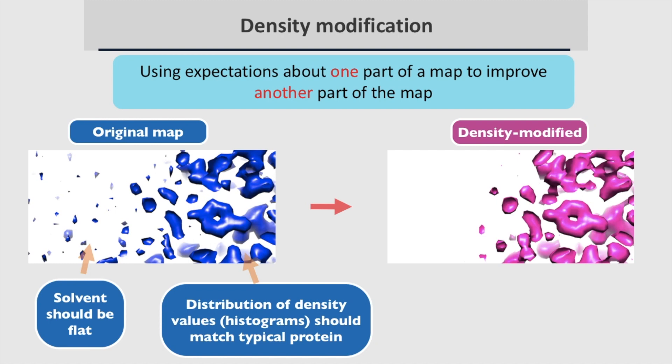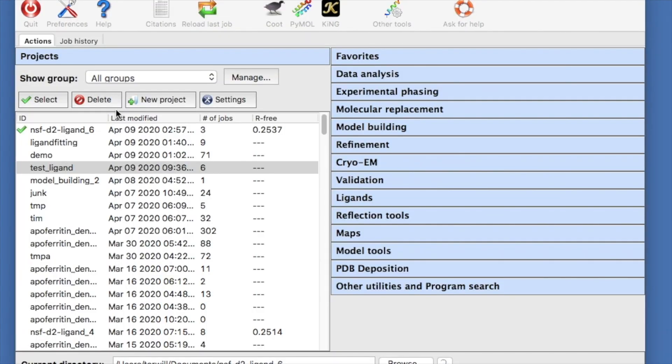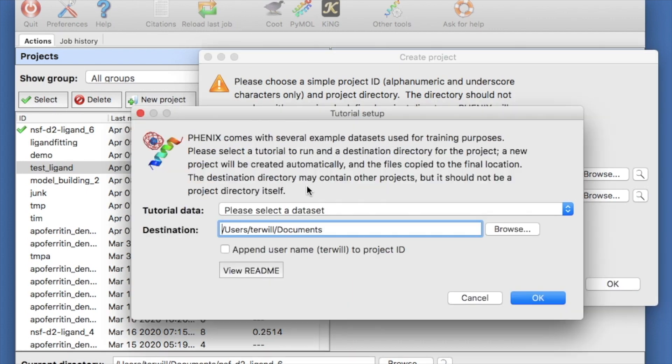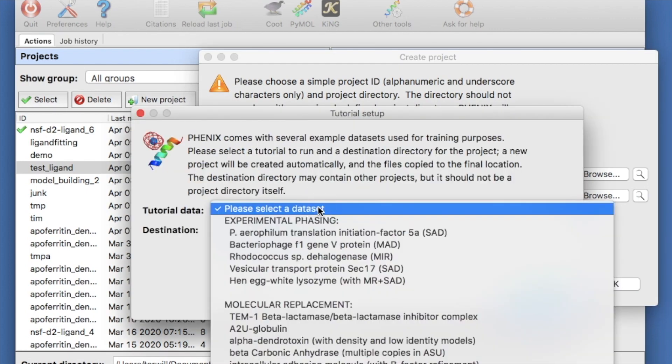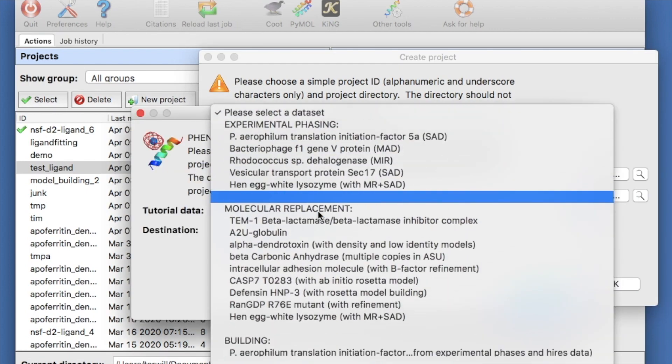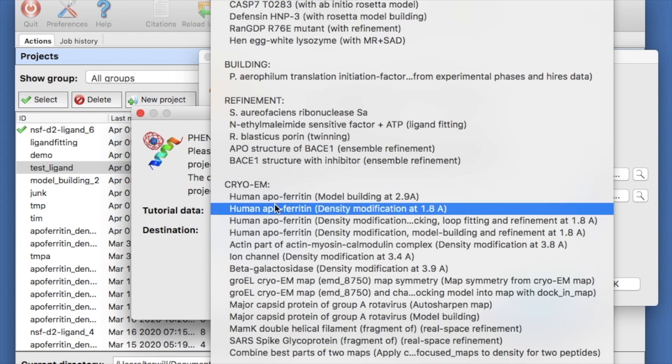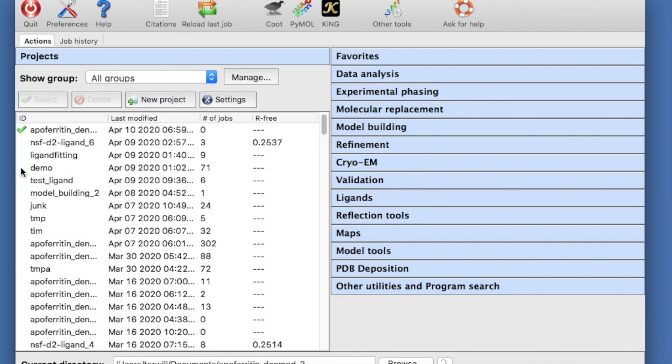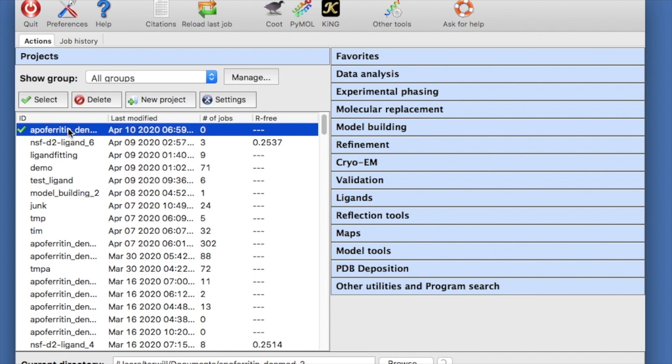Let's density modify a Cryo-EM map now. We are going to use the 1.8 angstrom map of human apopheritin from the Phoenix density modification tutorial. In the main Phoenix GUI select New Project, then click on Set up tutorial data and select a data set. Scroll down to the Cryo-EM section and select Human apopheritin density modification at 1.8 angstroms. Then click OK. There will now be a new apopheritin project with tutorial data in a new directory. We can click on it to select it.